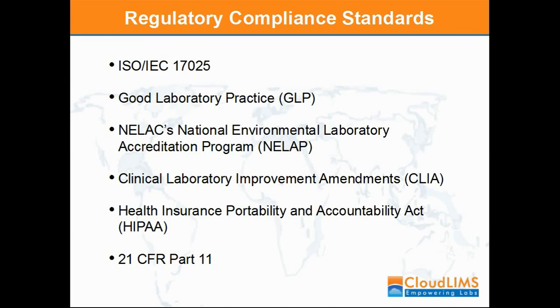NELAC. An environmental lab will be recognized as a NELAC accredited lab with the generation of environmental lab data of known and documented quality. This data from the sampling process should be generated through the adoption of national performance standards accredited under the NELAP program. CLIA, the Clinical Laboratory Improvement Amendments program. It regulates labs that perform testing on human specimens in order to ensure accurate and reliable test results.